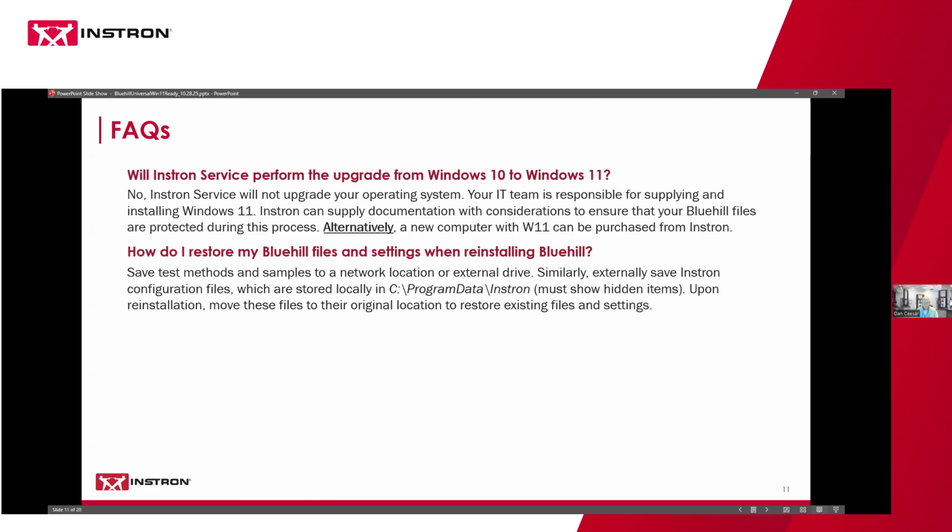Similar to test methods and your data, there are Instron configuration files for all the settings of transducers and things that are stored locally on each machine's computer in a hidden folder, ProgramData\Instron.